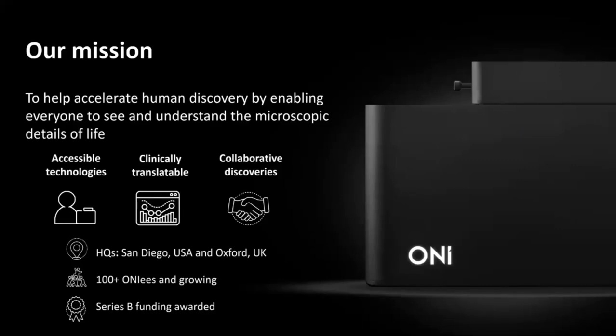A little bit about our company. ONI's mission is to help accelerate human discovery by enabling everyone to see and understand the microscopic details of life. We aim to do this by providing accessible technologies that are clinically translatable, and we aim to promote collaborative discoveries together. We have two headquarters, one in San Diego and another in Oxford. We have over 100 employees and we're rapidly growing, and we've just received our Series B funding.